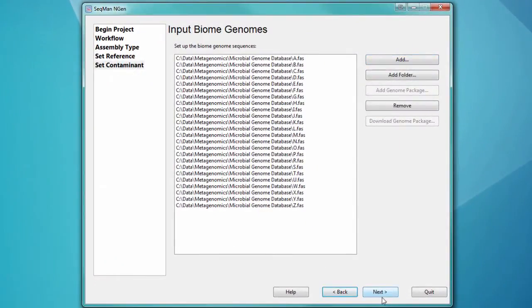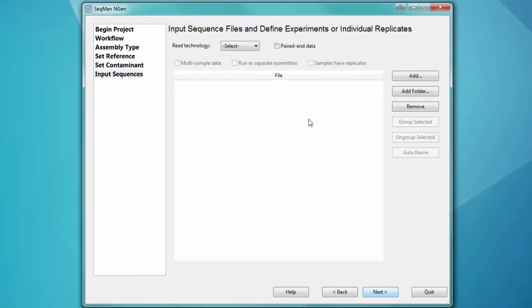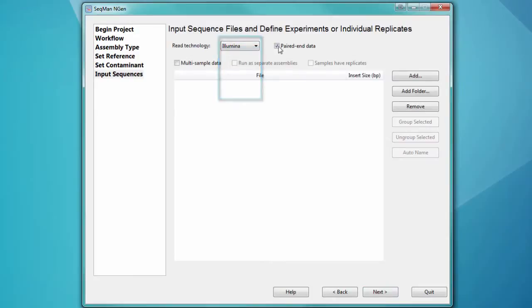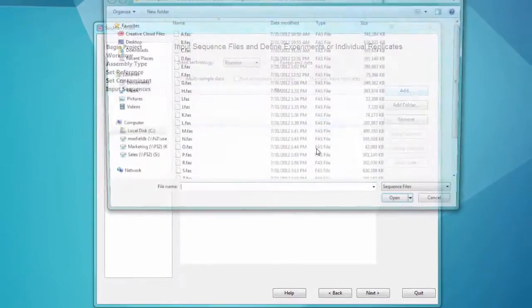You can also load data downloaded from other sources, including a variety of 16S databases. Next, designate the read technology, and then load your sequencing data.